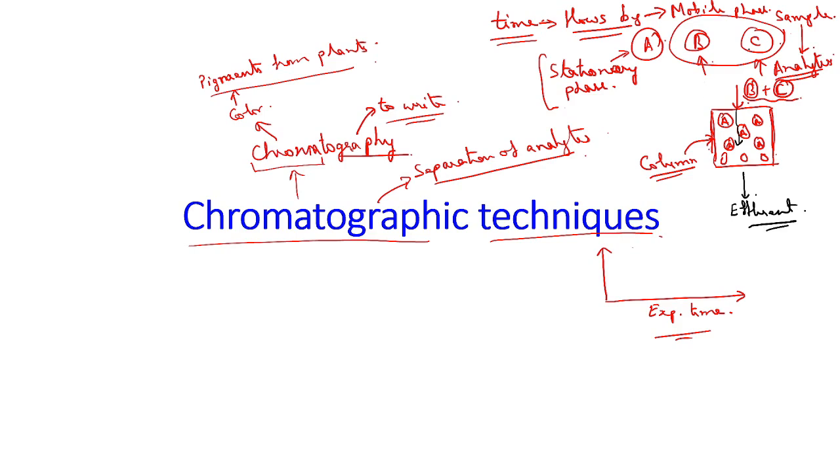Now what we said initially, the C analyte or the C group of people are not very close to you. So what will happen during the party? They will be the ones who will be moving faster, and they will be moving out very quickly.